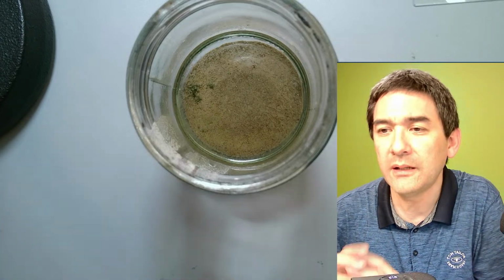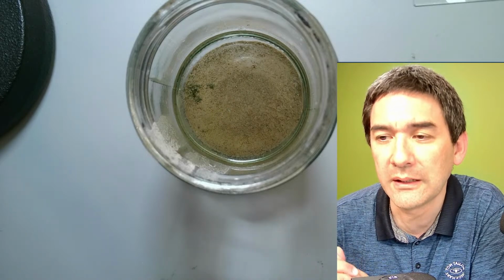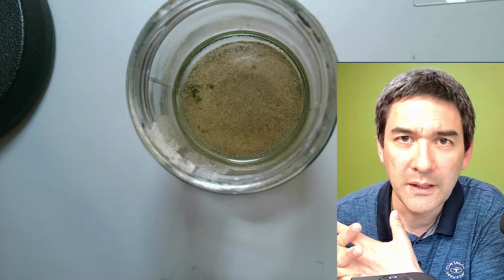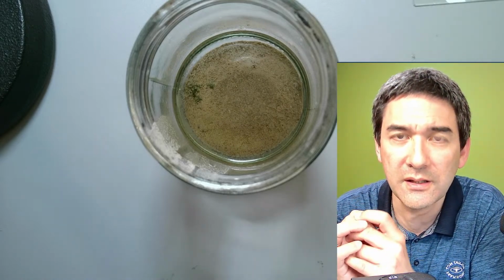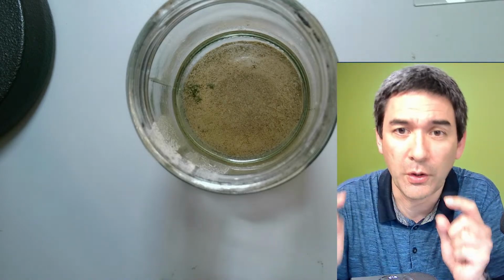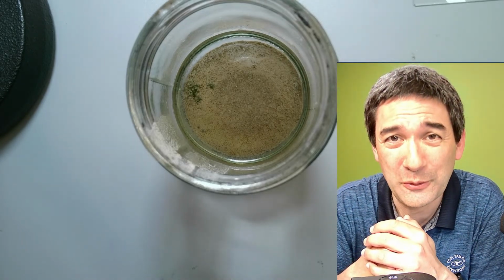When I connect a mirrorless Sony Alpha without an adapter, I get a reflection in the middle. That is, sometimes when you connect the camera you get a bright spot in the center, and sometimes this is due to the fact that the edge of the tube also reflects light. Köhler illumination would be the solution here.